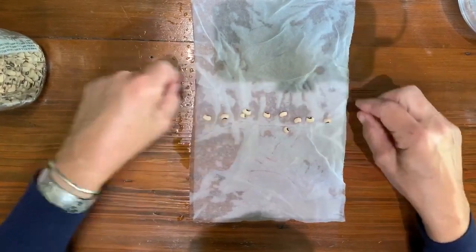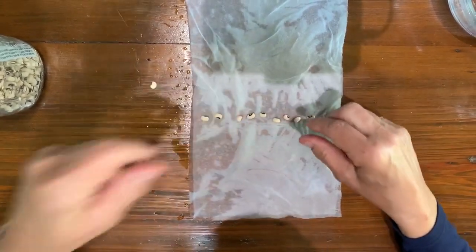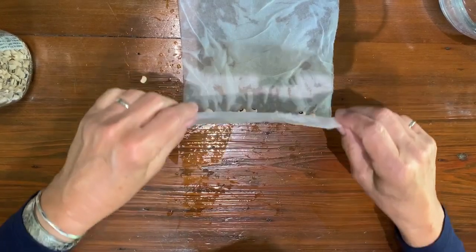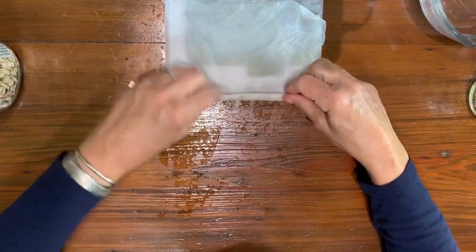We've got our 10 seeds. I'm going to fold it with the peas in it — and there's my little pea line. Then I'm going to roll it up.